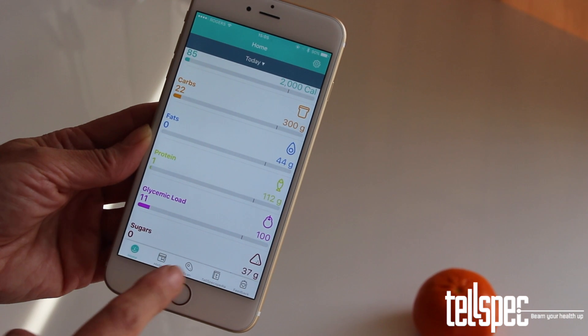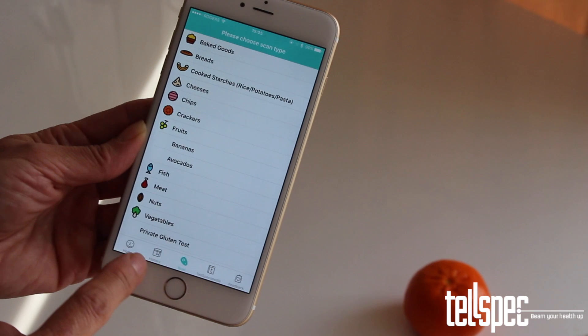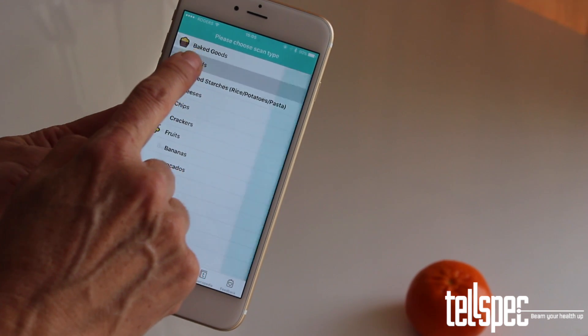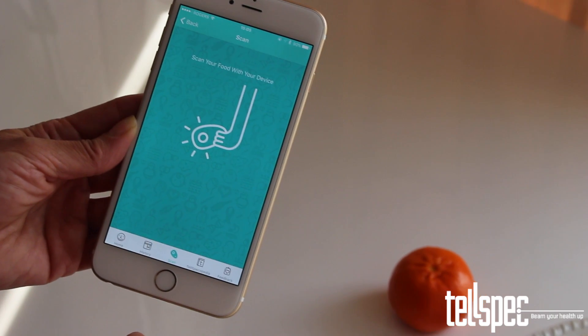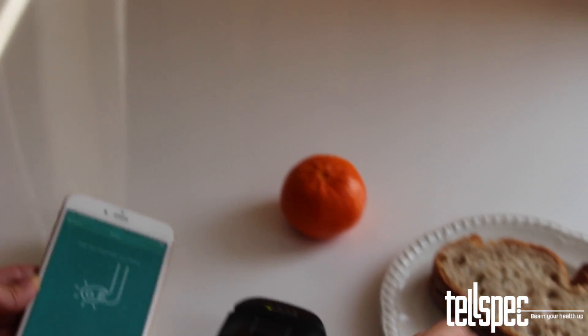To scan with your scanner, start the app and tap Scan on the bottom menu bar. On the next screen, tap the type of food that you are scanning. You will now be taken to the scanning screen where it will ask you to perform the scan.